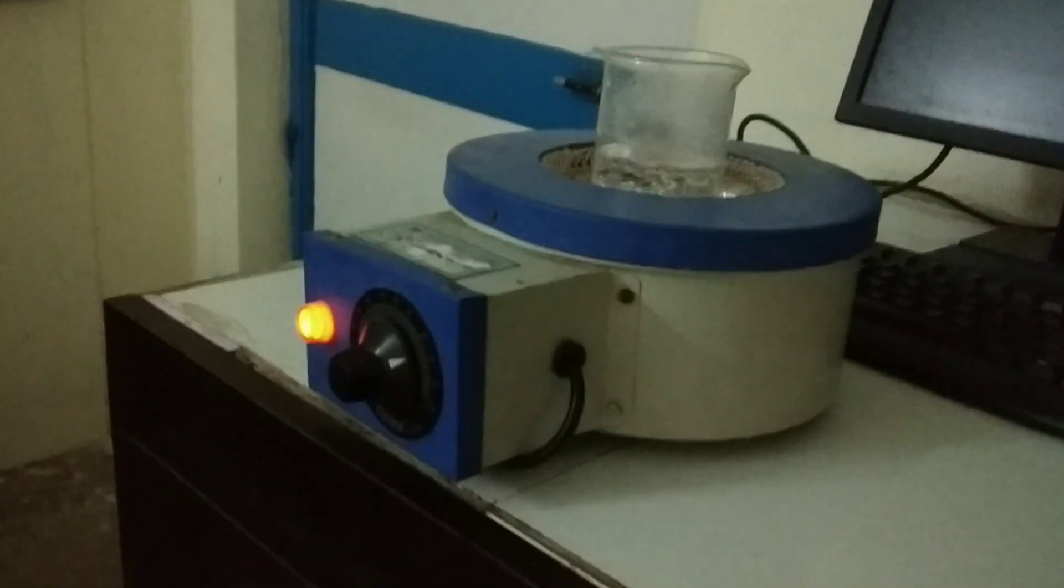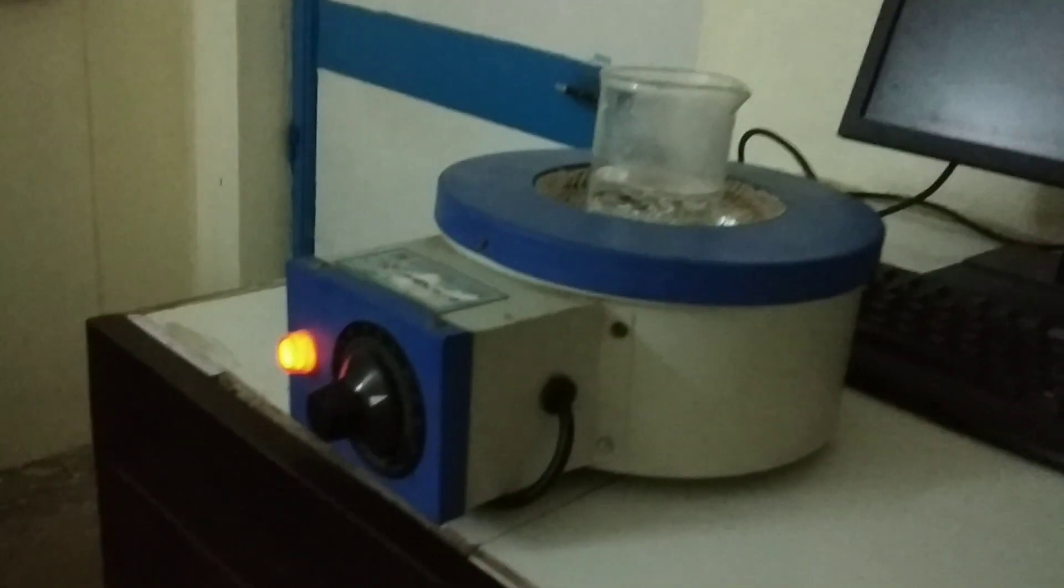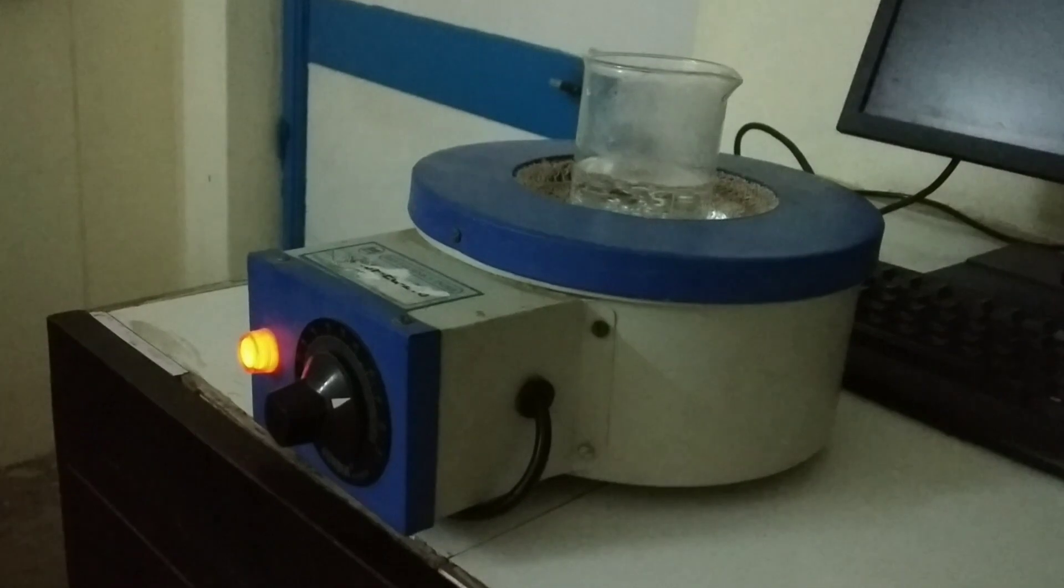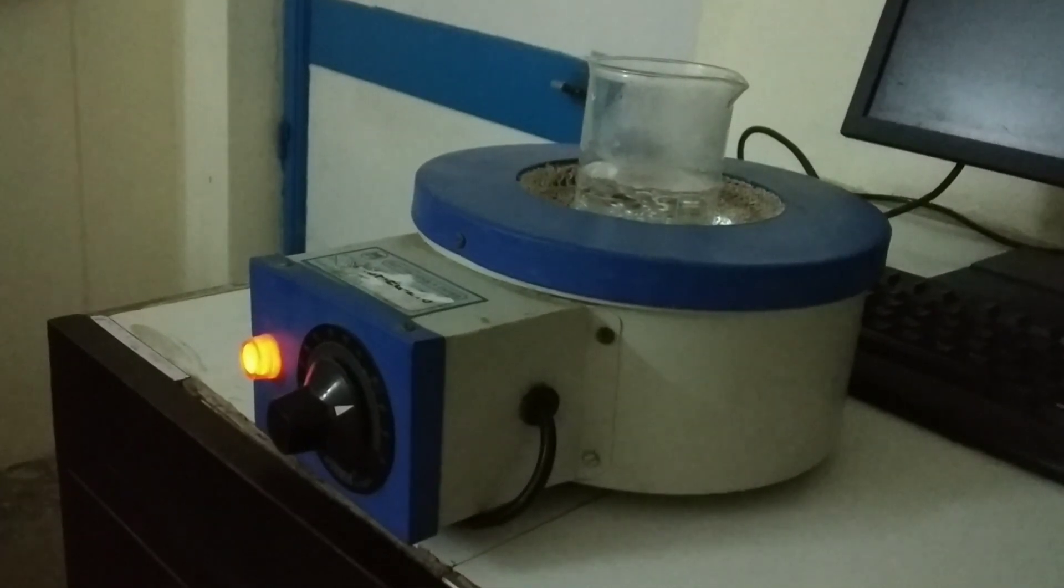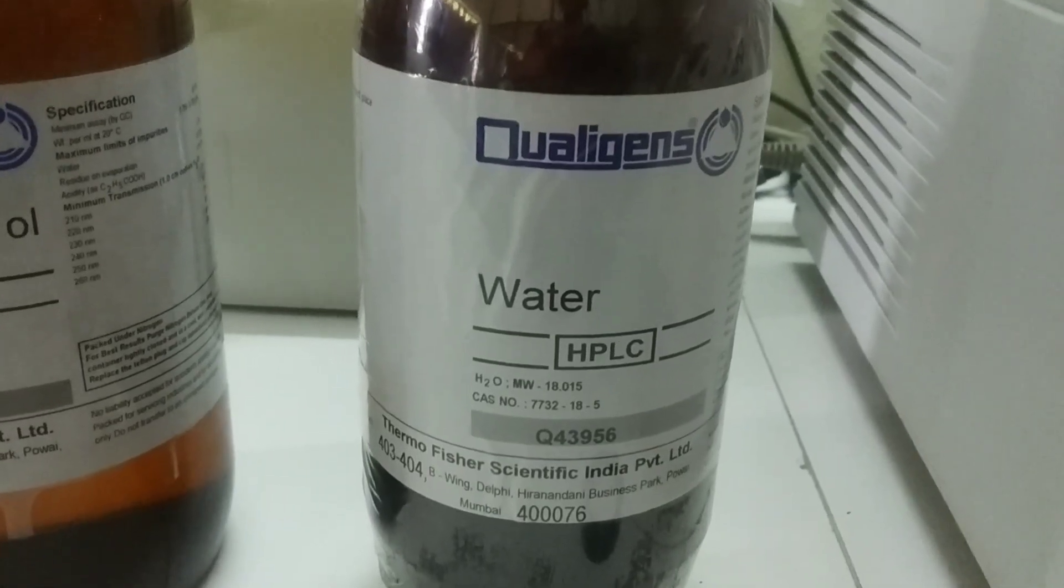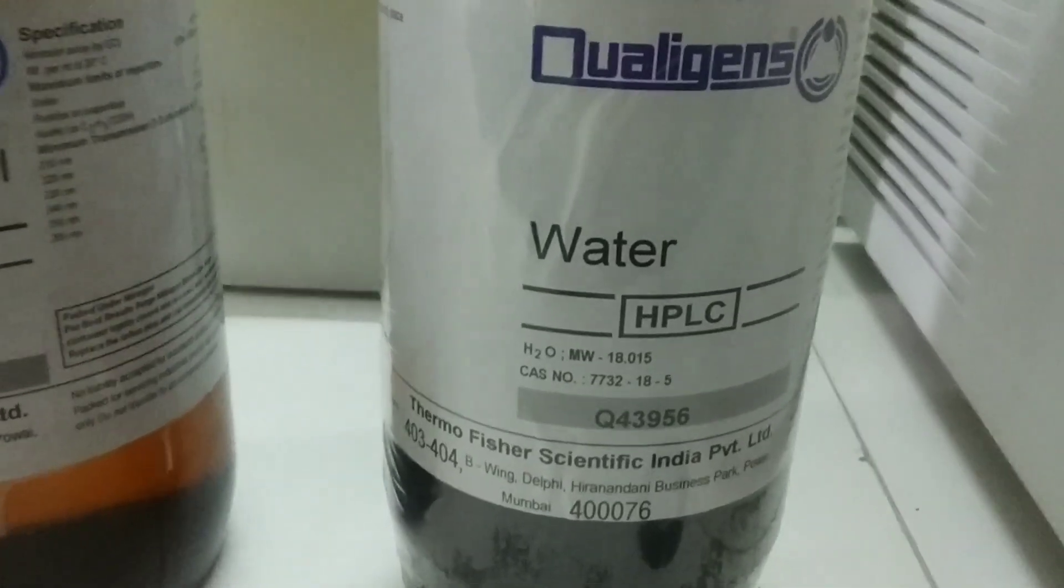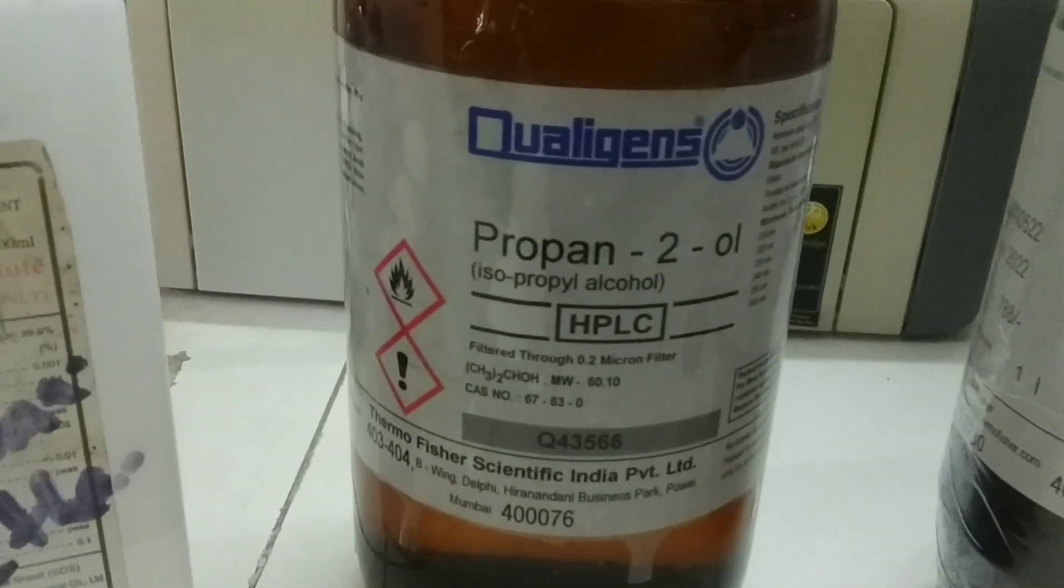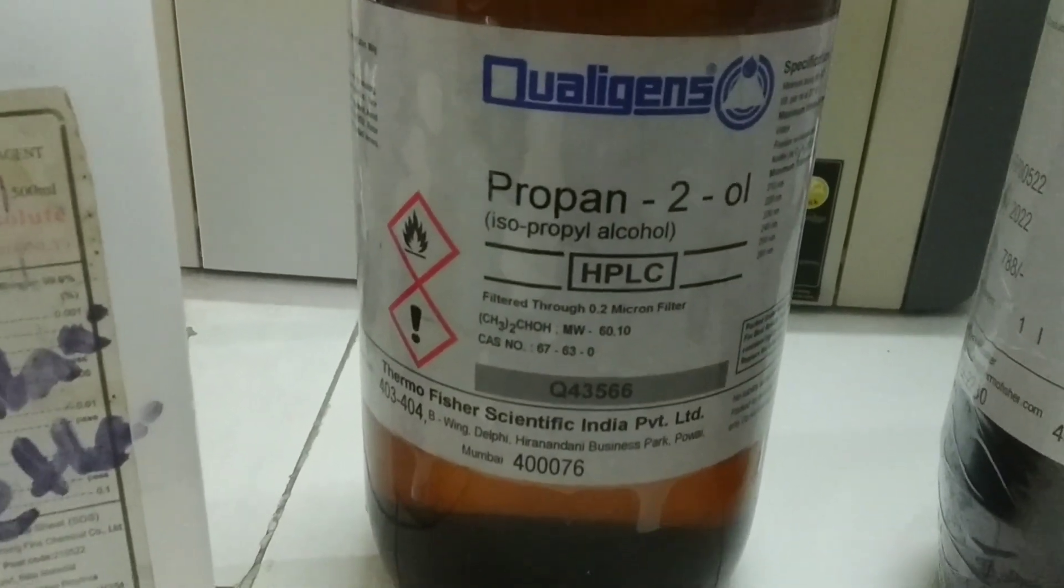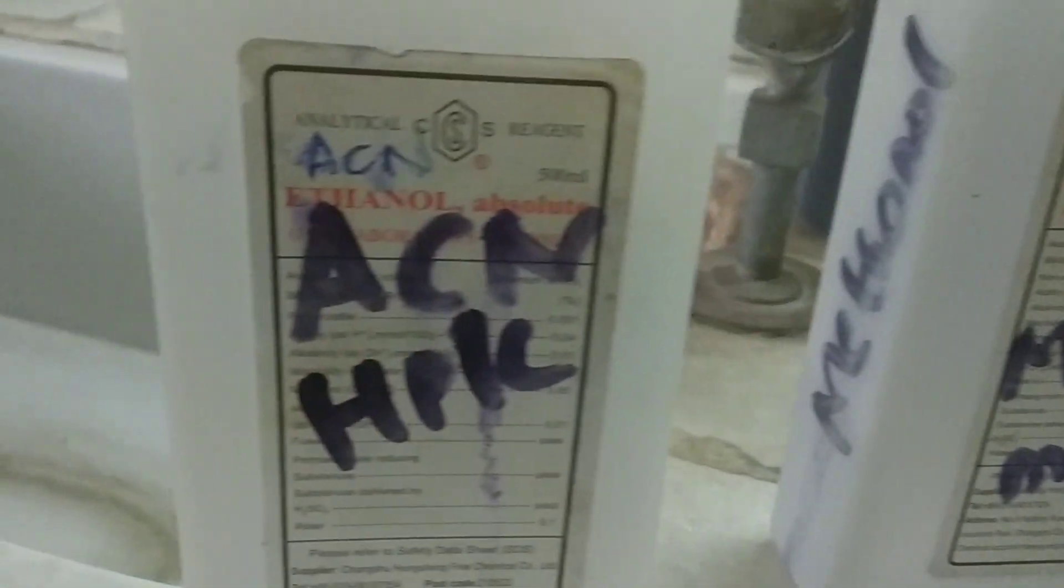For this, I'm using HPLC grade water heated to around 60 to 70 degrees centigrade over a mantle. Here is the bottle of HPLC grade water, then HPLC grade isopropanol, HPLC grade methanol, and HPLC grade acetonitrile. These are the solvents I'm using for cleaning the HPLC column.